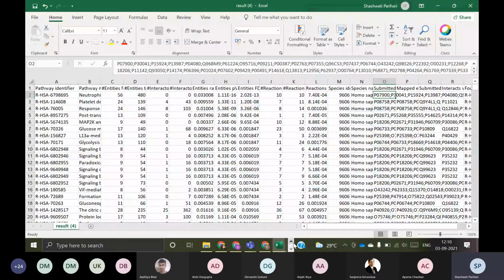or the camera one. Here you can add the data set. You have to add the intensity data set. From MetaboAnalyst, you can download the normalized data file, and that normalized file itself you can use. I have the normalized file, test normalized. You can upload that file and annotate it here in the Reactome.